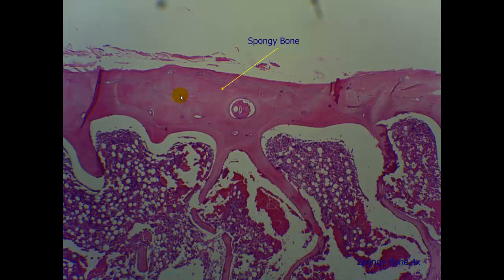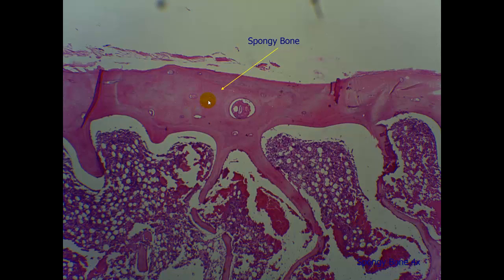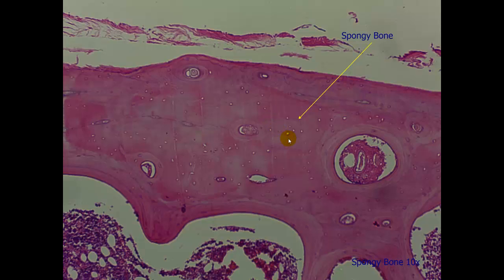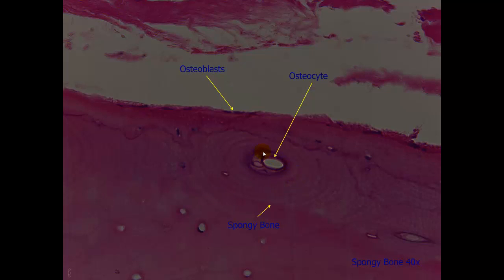Here is our slide of spongy bone. You can kind of see the lacunae. Those are the clear dots that you see within this tissue. Let's take a closer look. Now it becomes a little bit more easily distinguishable. This is all spongy bone. One more closer look. And now you can clearly see the lacunae here that houses the osteocytes. This is all spongy bone. We can also see right at the edge here osteoblasts. Keep in mind osteocytes help maintain the bone and osteoblasts help to build it.